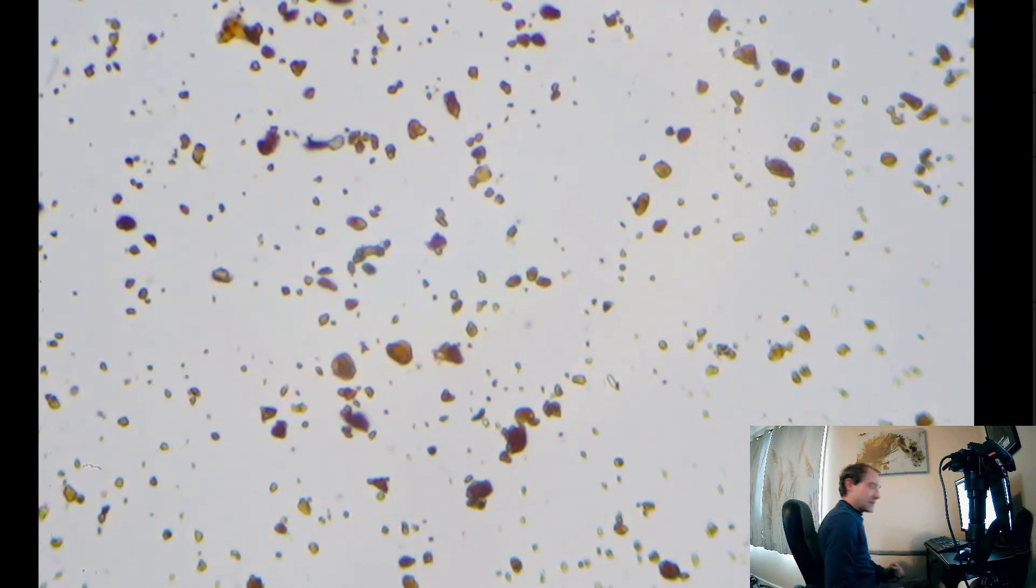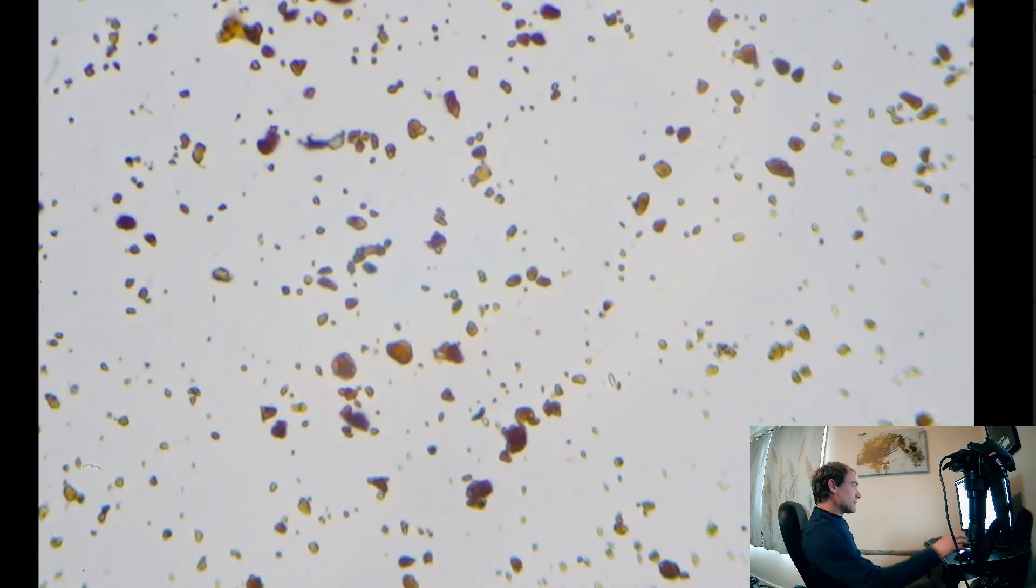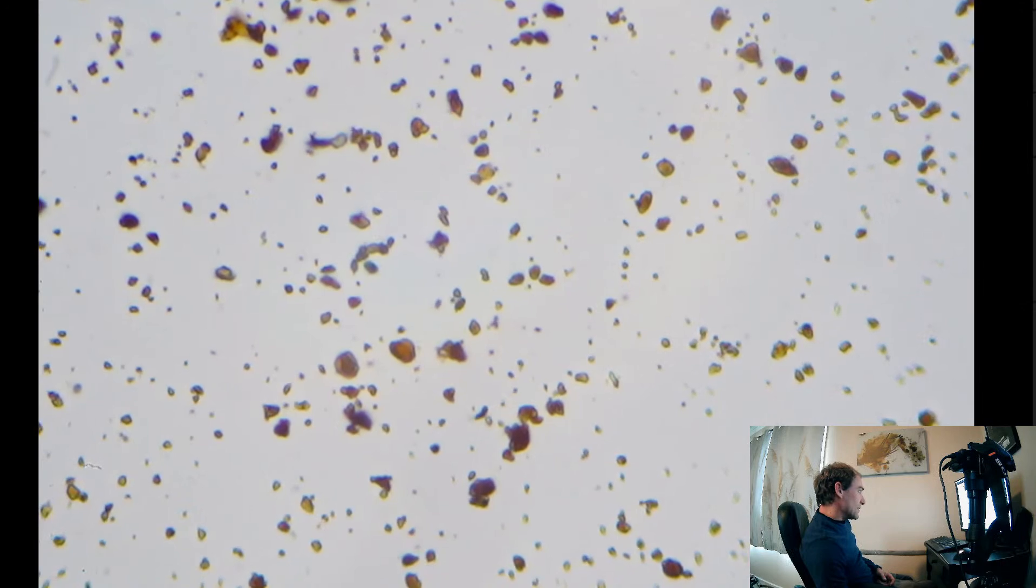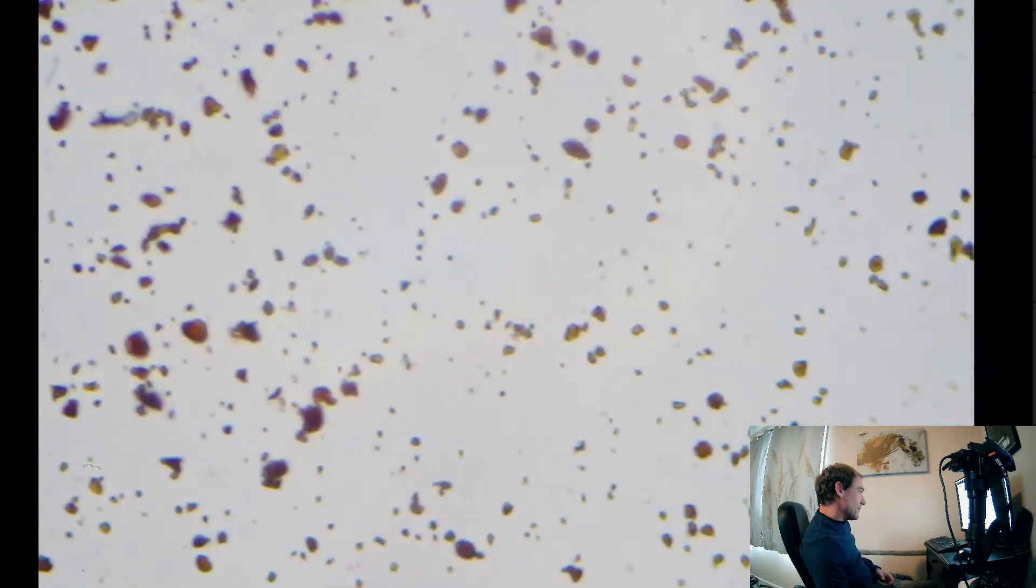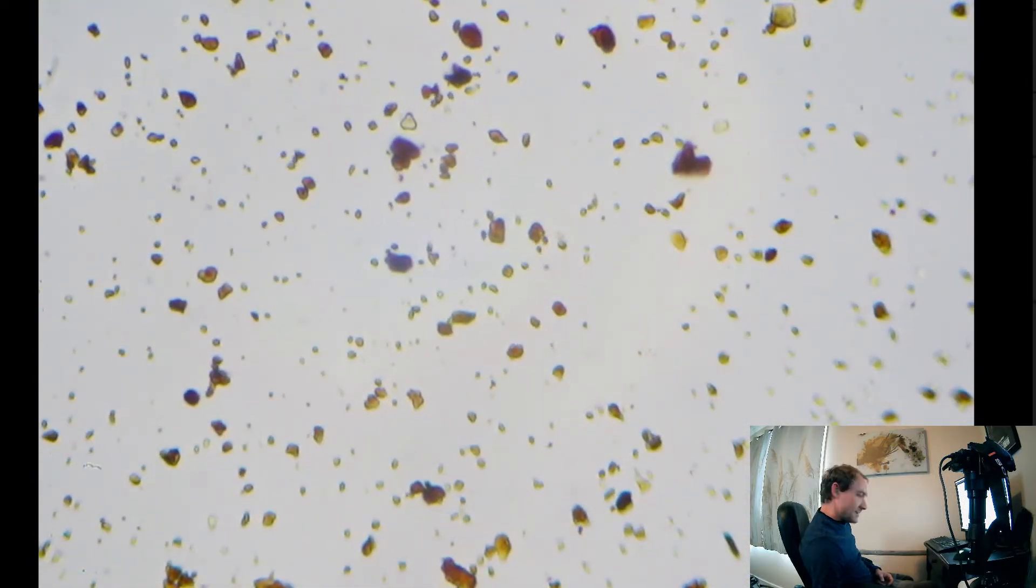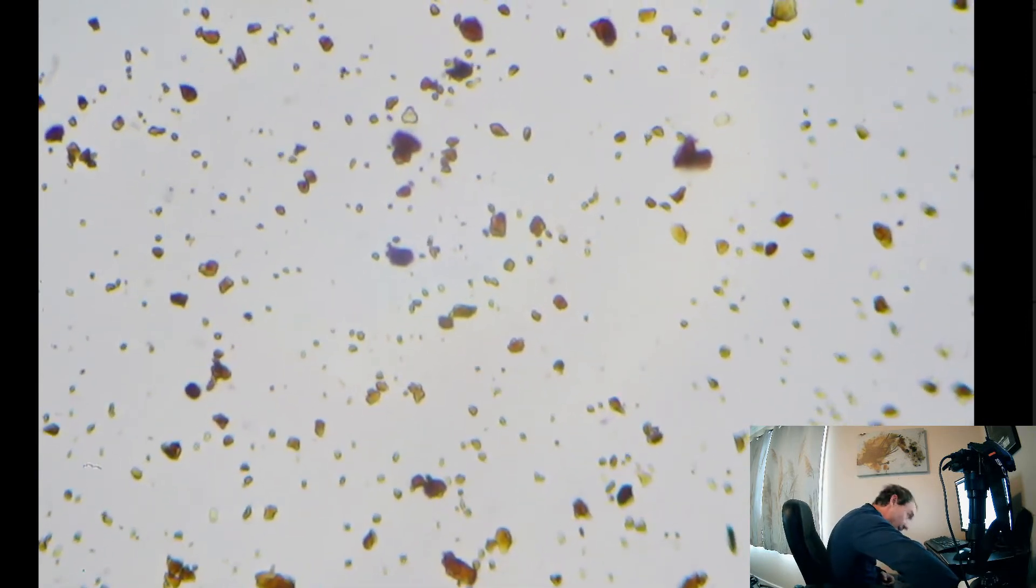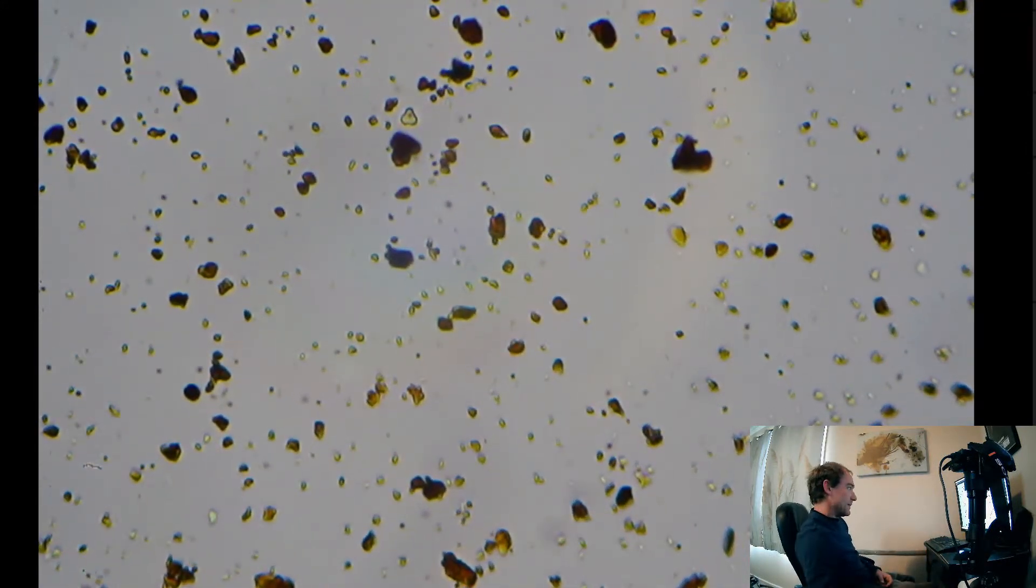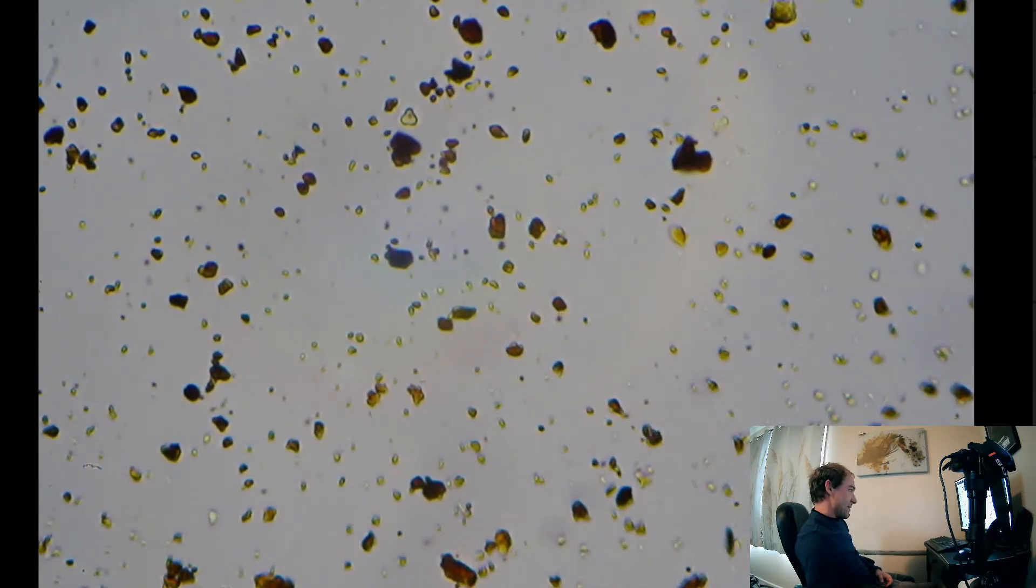Not sure if that's little tiny pieces of minerals or nutrients, but anyway, here's a really good example of a bacillus bacteria, little pill shapes wiggling about. Those are always good to see. Yeah, I think it was better with a little bit more shade. Get a little bit more definition. Yeah, right about there.